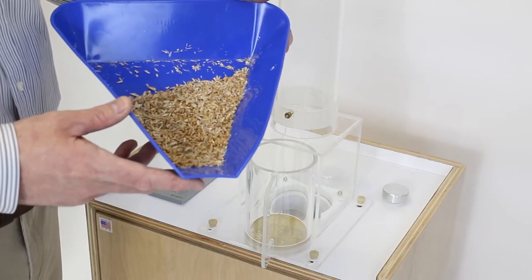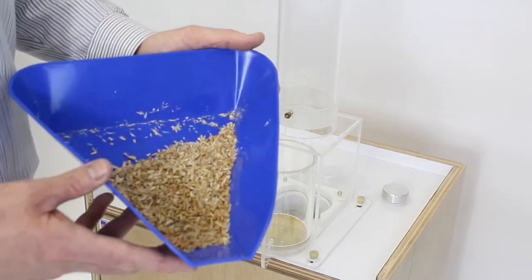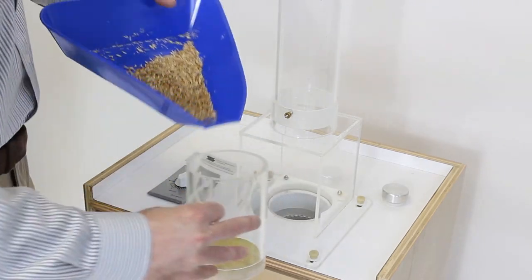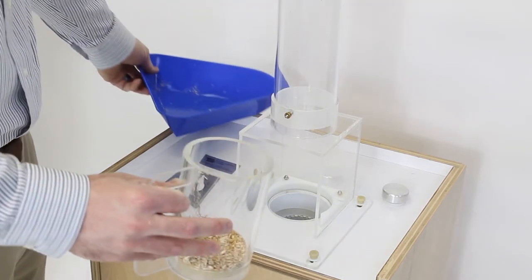Our sample is spelt with some of its chaff and dust and debris mixed in. We're going to take that sample and place it into our lower cup on the 757-RC tube set.